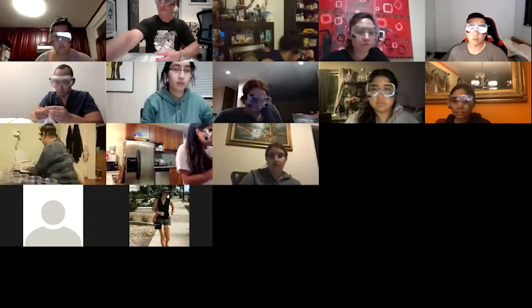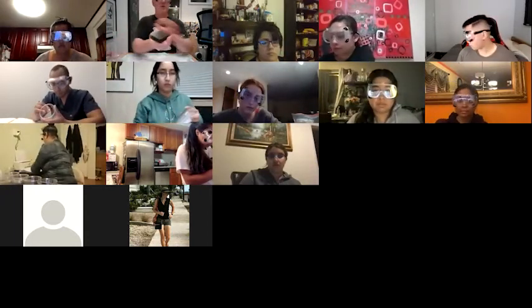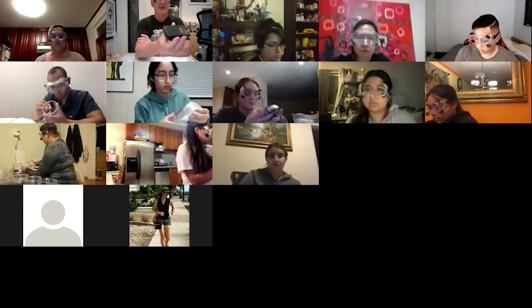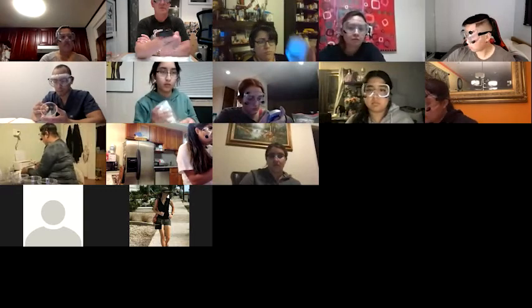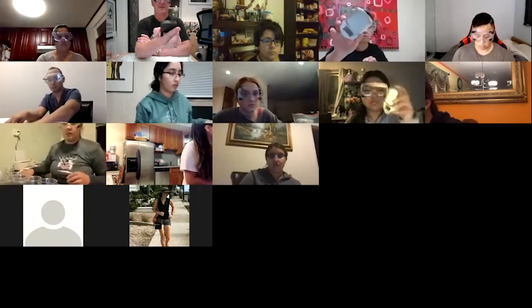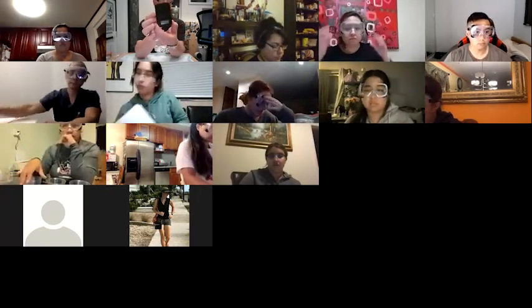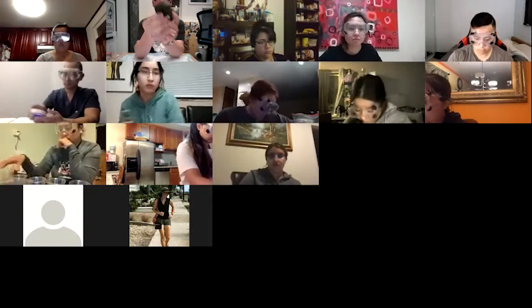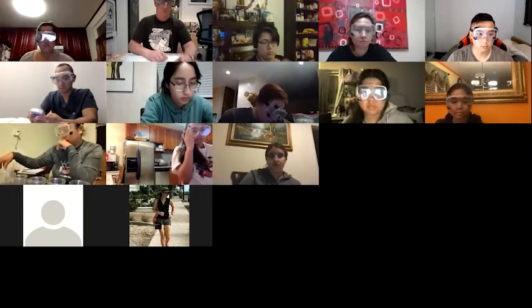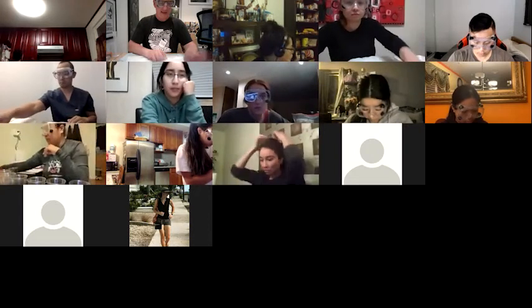All right, 20. Okay. So here is your balance. I don't know what your particular balance looks like. Mine looks like this. Yours may look different. I got one of the old ones from last term. They all work the same. There's two buttons on them, one on the left, one on the right. The one on the right turns it on. So give it a second to let it go.